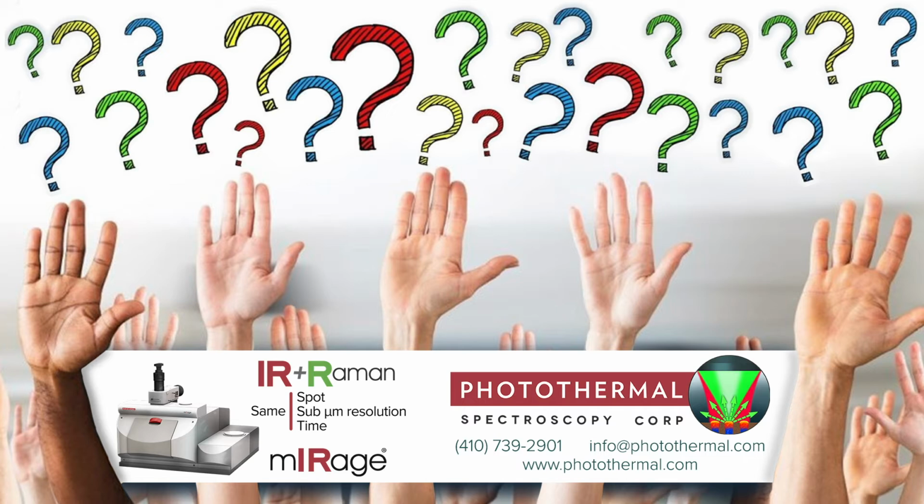I think there is an absorbance gap in the resonance Raman. I don't know. Do you get much resonant Raman at 532? Oh, yes, proteins mainly.